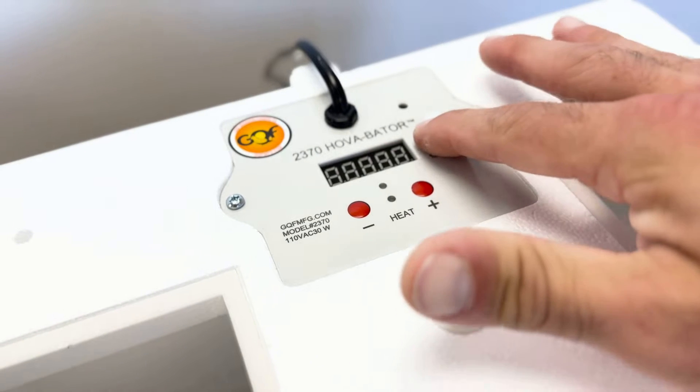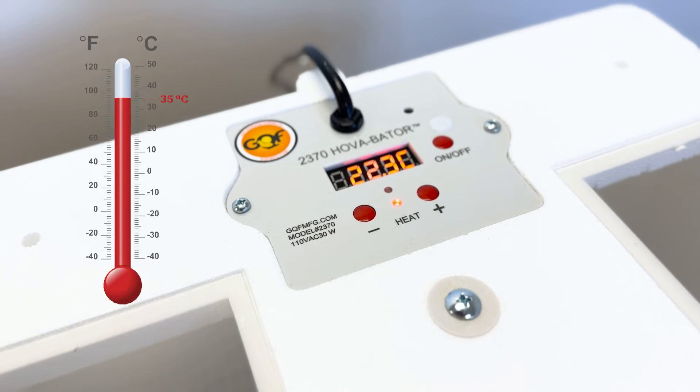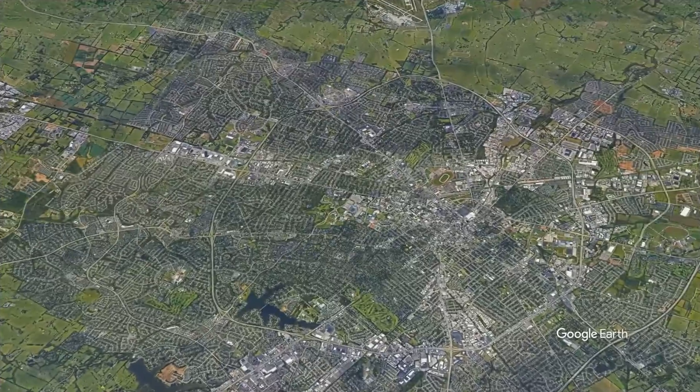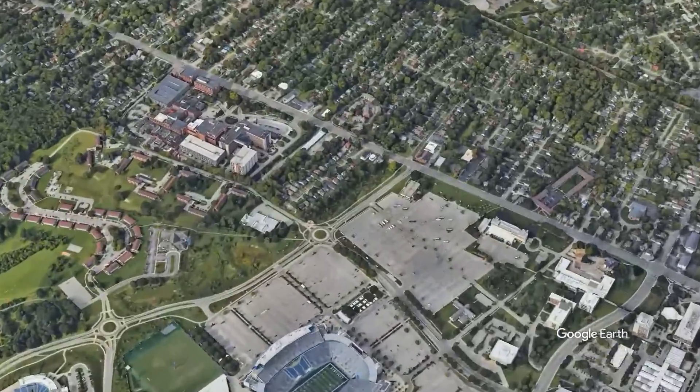Before we go out to our sampling location, we want to set the incubator to 35 degrees Celsius so that it can be ready for us when we return from the field. Now that we've packed our supplies, let's go collect a sample.